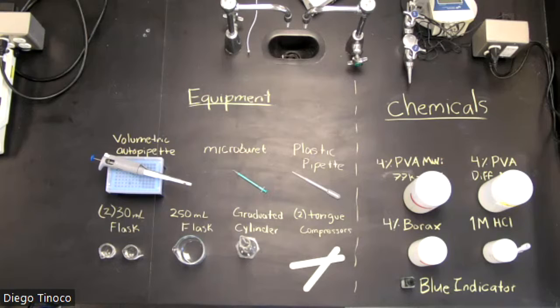Now let's talk about what we are going to need for this lab experiment. Here, you can see I divided our equipment and our chemicals.